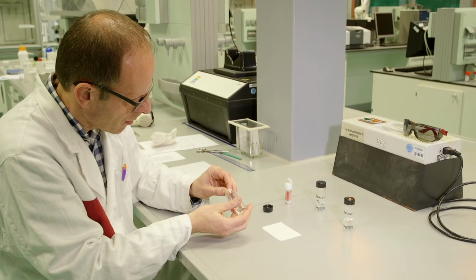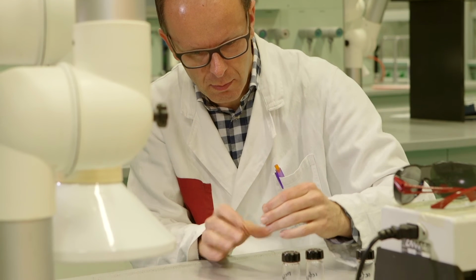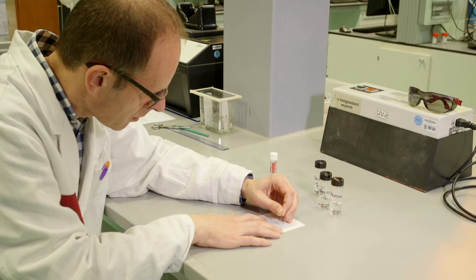To identify the substances in the sample, 1 or more reference substances can also be applied. The distance between the substances should be about 1 centimetre. Do not draw the dots too close to the sides.